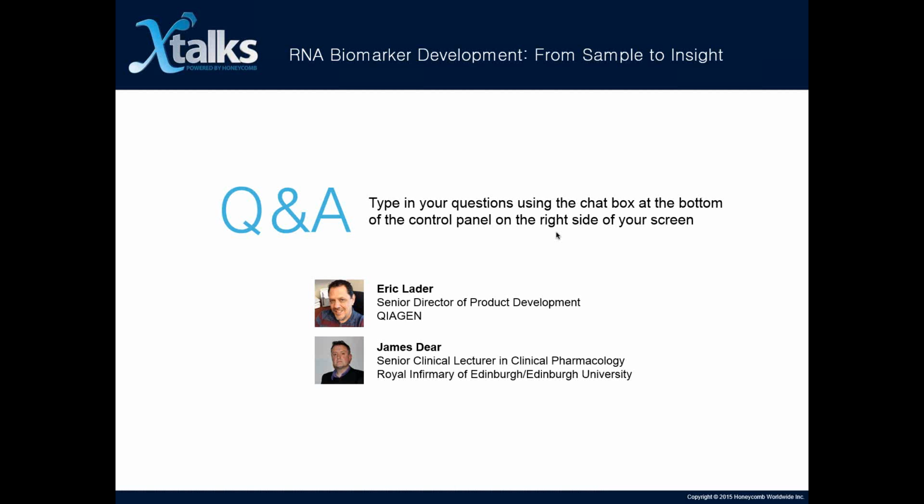And I think there's a lot of merit to that. I think as biologists, we're used to working in a concentration. So I think that's useful. I think the problem with absolute copy number is that it doesn't tell you if your sample's degraded, and it doesn't tell you anything about the extraction. So you can put a spike in, so you can take a microRNA from C. elegans and look at the extraction, look at the PCR efficiency, and then normalize to your spike in. Or perhaps the best way, perhaps not, is to find a microRNA in your sample that doesn't change with disease, that's stable across people, and express your microRNA as a ratio to that, which perhaps should overcome the problem with extraction. But I think until the field comes together and decides on how a microRNA's circulating concentration should be expressed, that's another roadblock to clinical adoption.